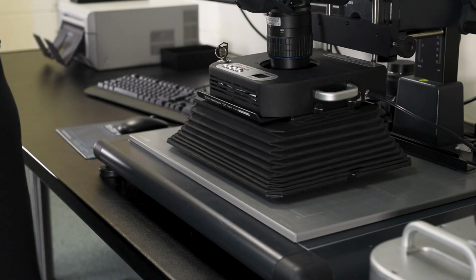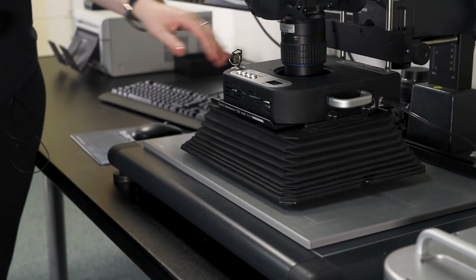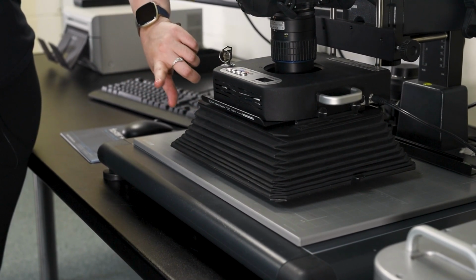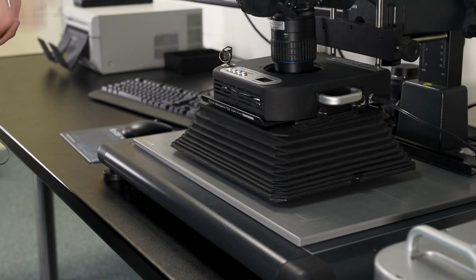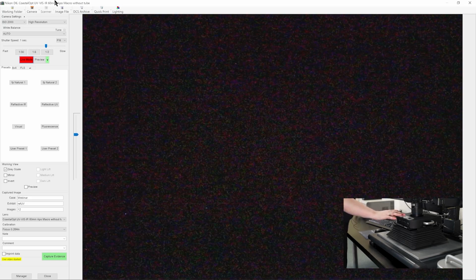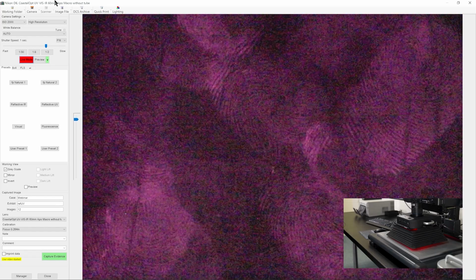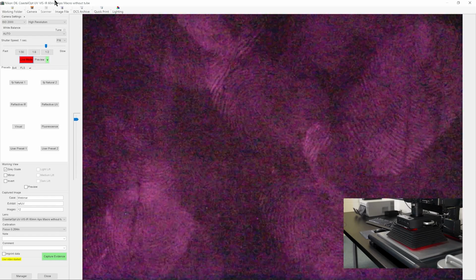You can use a marabou style brush as well to remove any excess debris on the surface. But then all we're going to do is use, again, simple lighting techniques. So we have our Crime Light 8x4 here, and we have our special sharp cut filter that's provided for use with FP Natural 2. Now, FP Natural 2 we can illuminate in two different ways. The first way is simply to illuminate with a red light source. When we turn on a red light source, what you get is the fluorescence inside the infrared part of the spectrum, even though we're still illuminating in the visible.